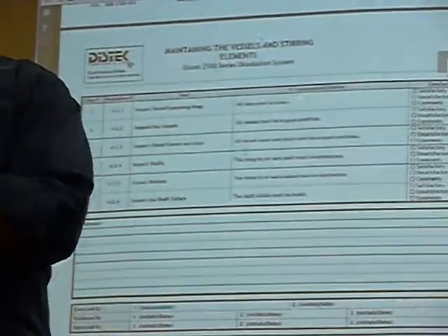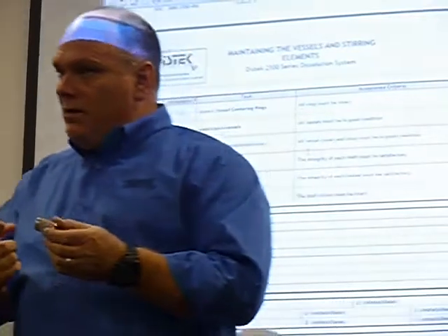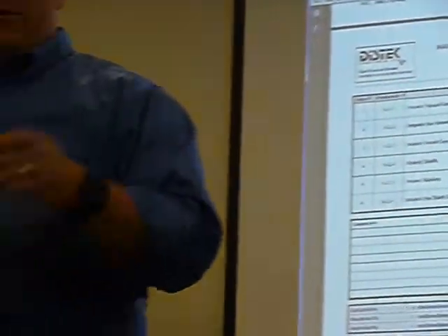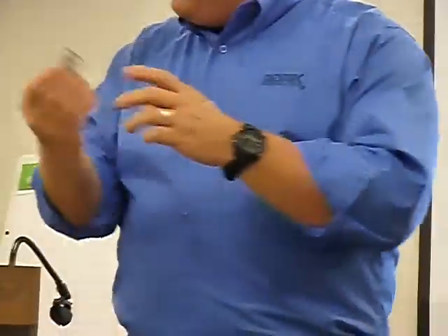Another thing too is to feel. Make sure there are no spurs, no pieces of the metal turned upward. Because any little tiny piece of metal hanging off of this, spinning around in the media, is impacting the testing. And that's not a good basket. They would need to replace it. So you want to make sure that it's nice and smooth and it feels fine to the touch.